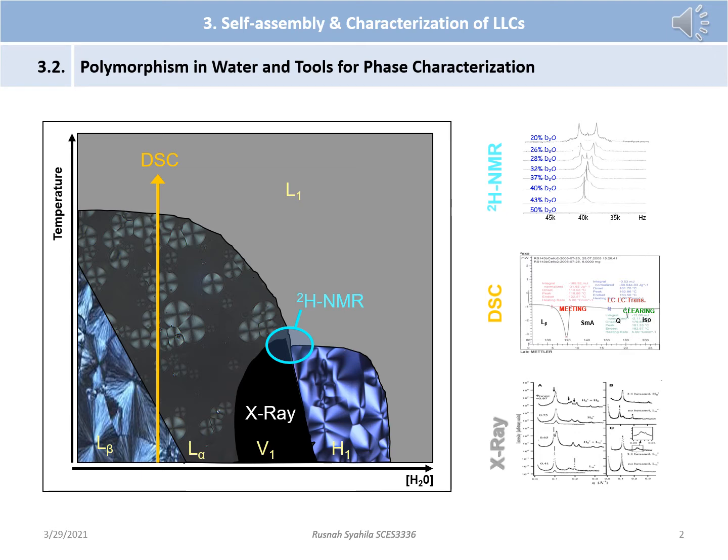OPM alone is not able to fully identify all the phases. It has limitations. Similar for the other techniques. We need at least 2 or 3 combinations of methods in order to confirm the phases for sure.